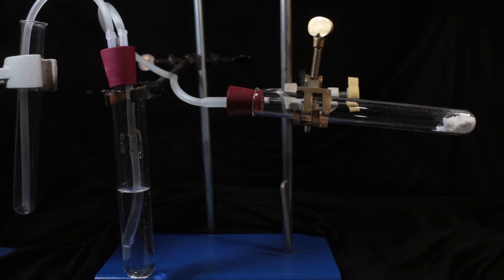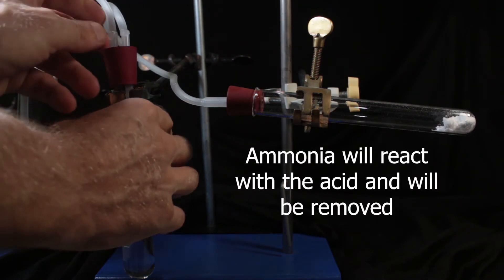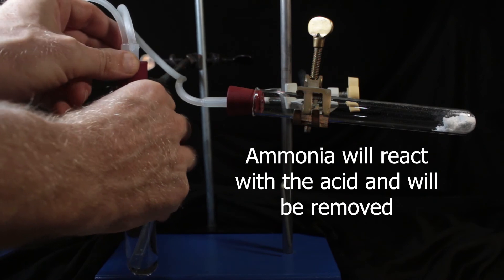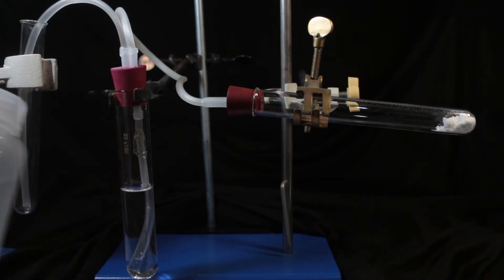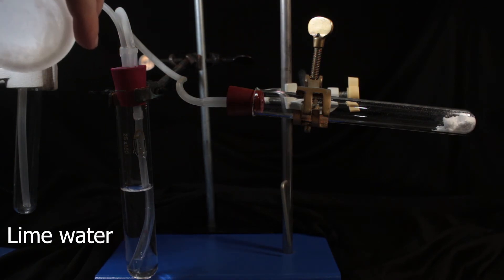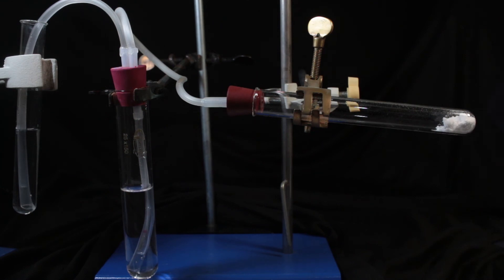Ammonia, being alkaline, will react with the acid and will be removed. And carbon dioxide would be left, and it's going to bubble through lime water on the extreme left. Here, let's run our setup by heating up the white solid.